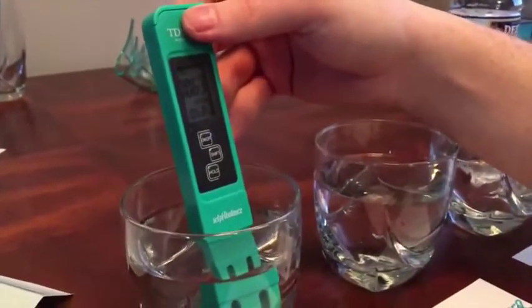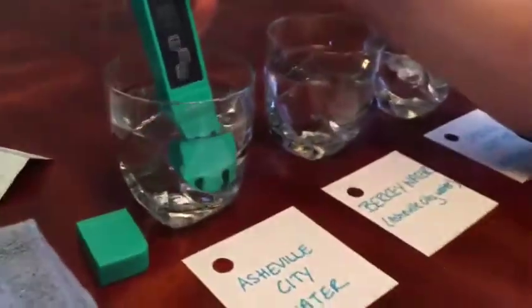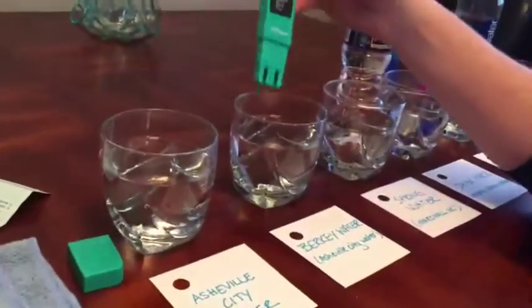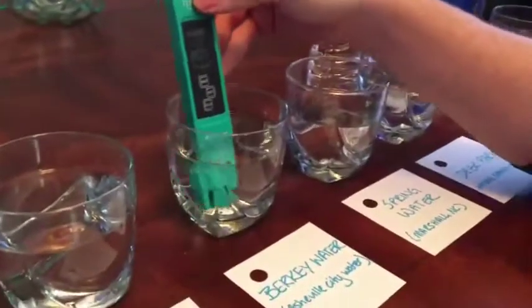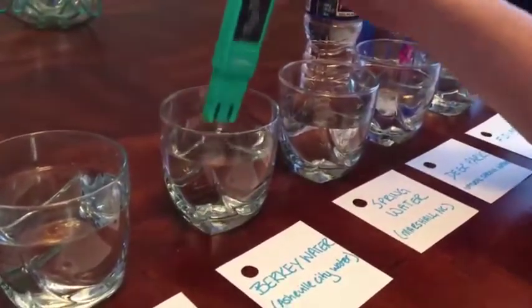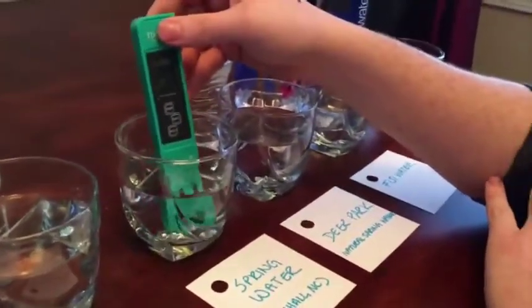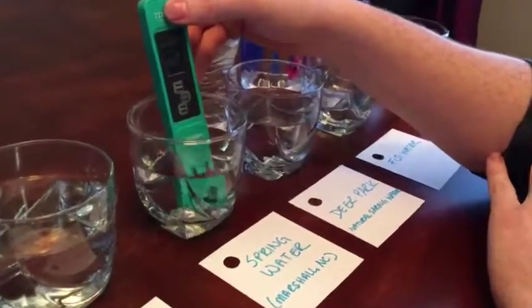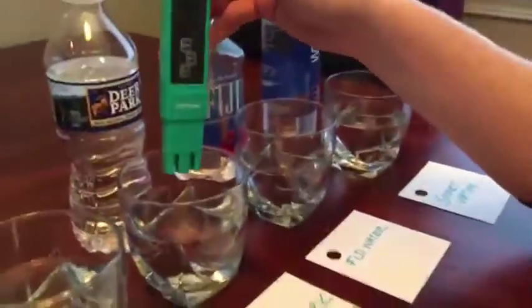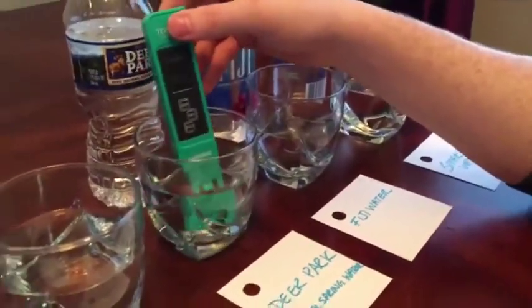Measuring Asheville city water, we get 63 µs/cm — a high metallic salt content. The charcoal-filtered Berkey water measures 56 µs/cm. The spring water from the North Carolina mountains measures 4 µs/cm, which is below the average acceptable level of 5.5. Deer Park water measures 6 µs/cm, slightly above the average.